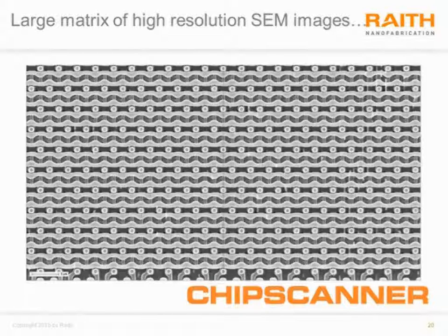But the stitching boundary is not some error in X or Y. This stitching boundary is actually a variation in signal intensity, which is another dimension of stitching errors that I'll come back to a little bit later. But here you can see really X and Y stitching is almost perfect.